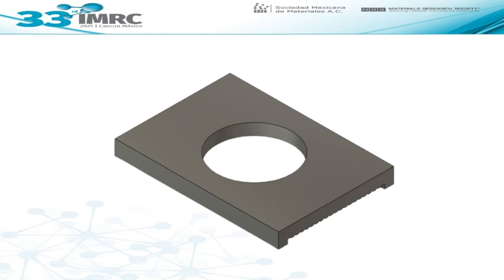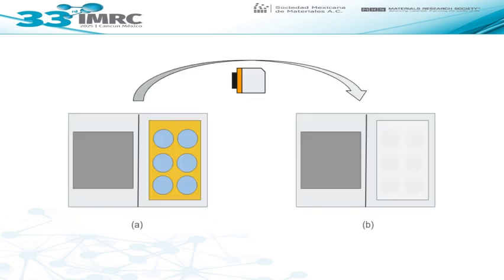Now, for the second stage of our work, we measure thin films of these aqueous solutions. We cannot use the same arrangement or the same sample container that we used in the previous stage. For this stage, we use another special container. In the diagram, the special container is exemplified by the yellow rectangle with the blue circles.